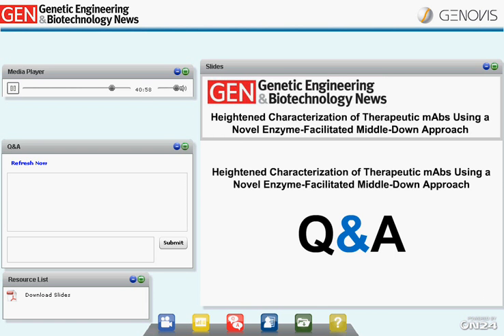Okay, can you comment on the preparation to analysis time required to perform the antibody subunit domain mapping assay for the analysis of sequence variants? Sure. Yes, the enzyme is quite robust, and it's very efficient. So the FabRICATOR enzyme allows us to expedite the digestion procedure, and it's not typical like trypsin or Lys-C where you'd have a 4-hour or overnight digest. Starting with protein A purified mAb, we're looking at about 3 hours from the purified mAb to having ultra-high-resolution MS results in hand.